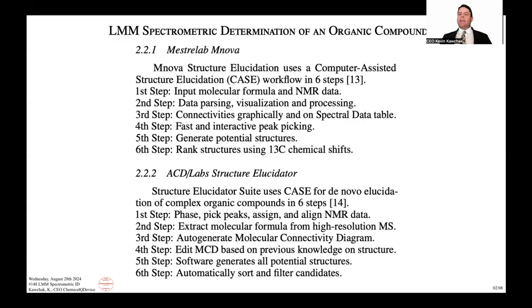It's very fast. The reason I did this is that what's on the market right now requires at least 6 steps to solve a lot of these unknown problems, where you have to pick the peaks and these types of things. In the large multimodal workflows, the only thing I had to do, because one of the models, the Google Gemini model, only accepts one image upload, is include high resolution images for all of them in a single image. Then the prompt is basically saying, please return to me the organic unknown. It's 2 steps: upload high resolution images, and then return the organic structure.